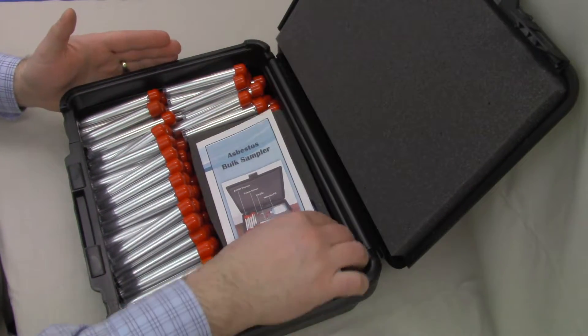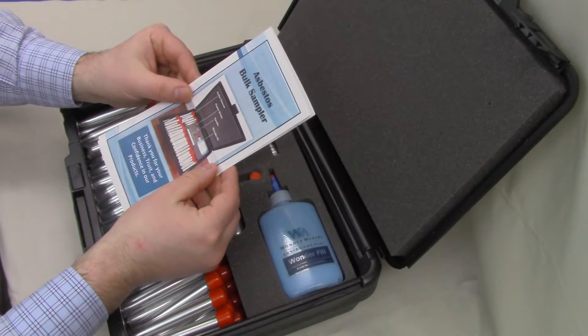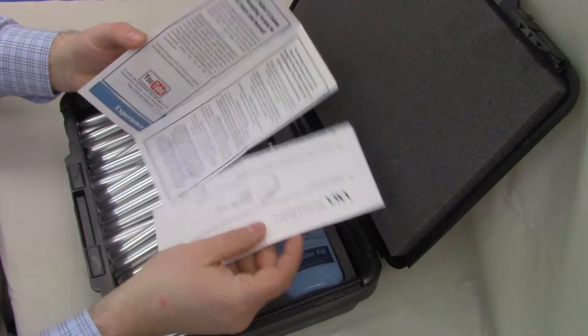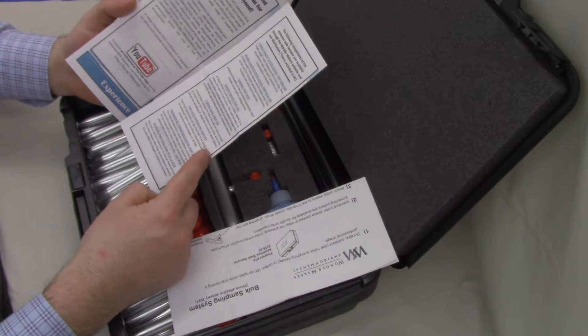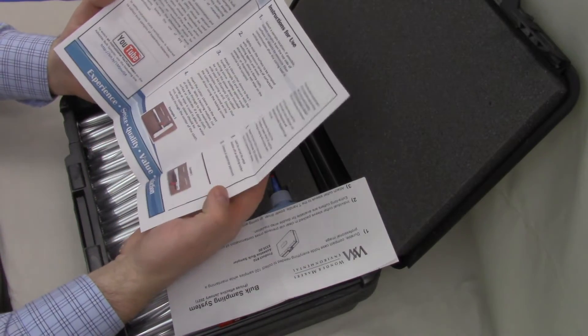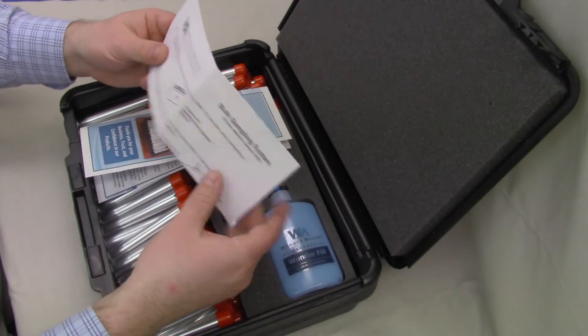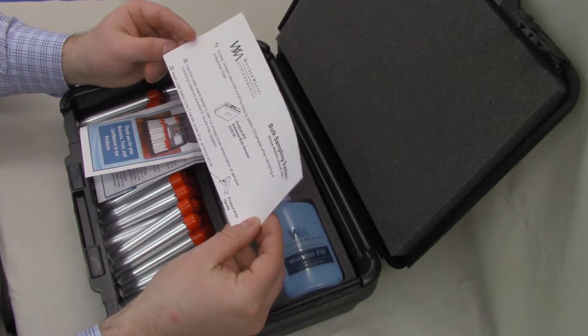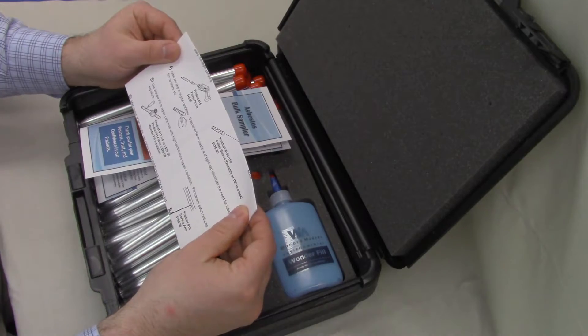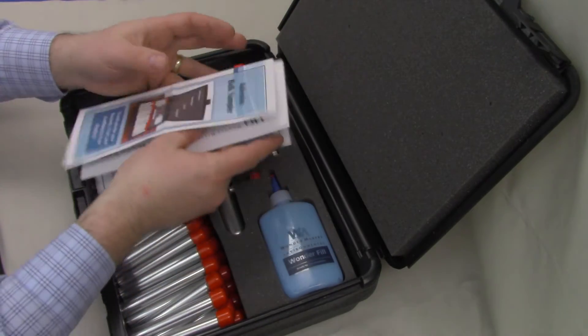To start off with, we have a brochure indicating the contents of the case, along with other accessories that you can purchase to work with the sampling system, and several quotes and a demonstration about how to use it. We also have an up-to-date price list, this is changed every year, containing the prices for those various different accessories that we talked about elsewhere in the brochure.